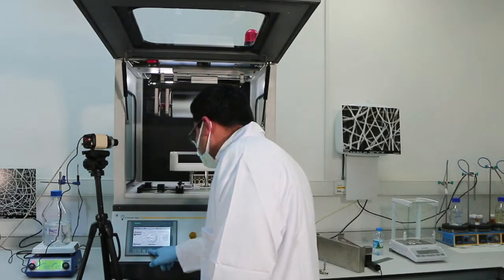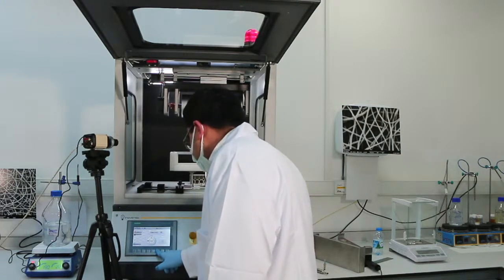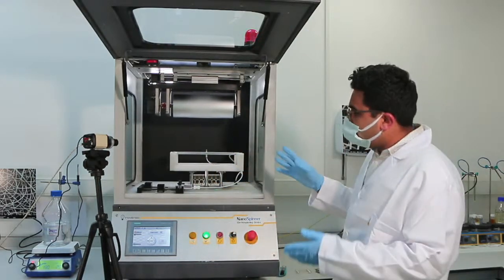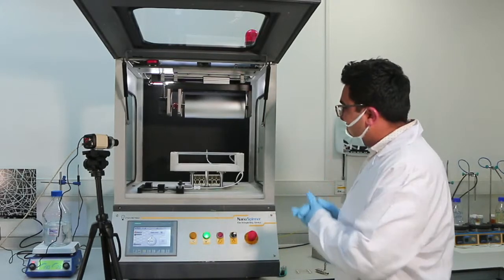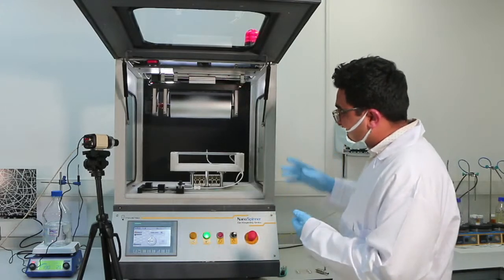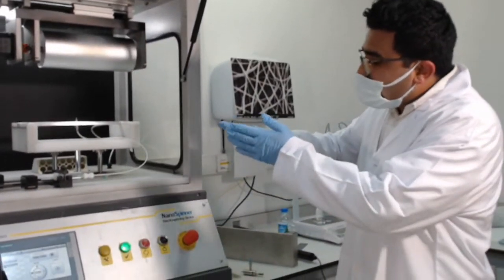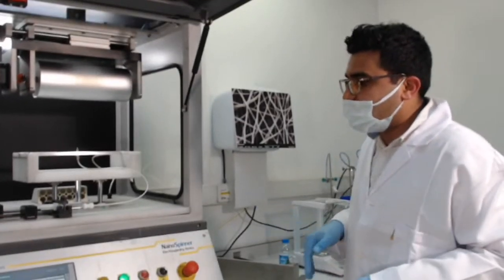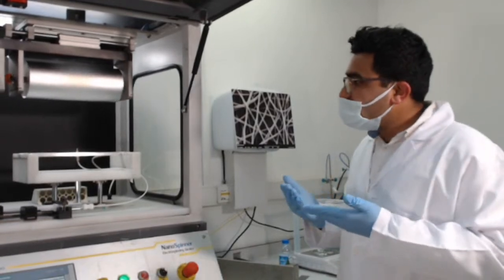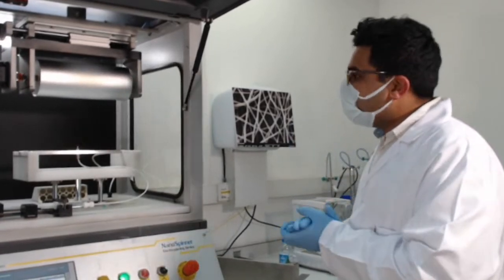So this is basically drum collecting. Also, there's a safe door feature. I'm not going to close the door right now, so that you can have a better look at the process. But what the safe door feature does is, in the event that somebody comes to the lab and opens it during the process, you can activate this safety feature in which the spinning process stops and goes to a halt. That is another feature in this machine that allows better control over the parameters and the process.